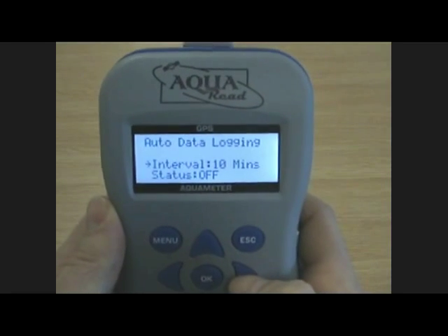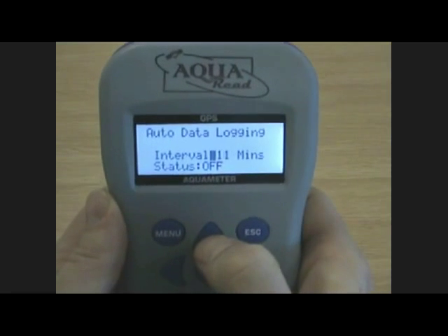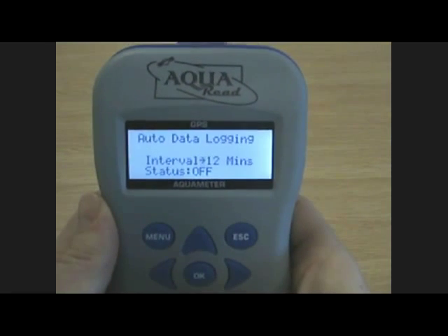If you select auto data logging, you're able to adjust the data logging interval anywhere between 1 to 99 minutes.